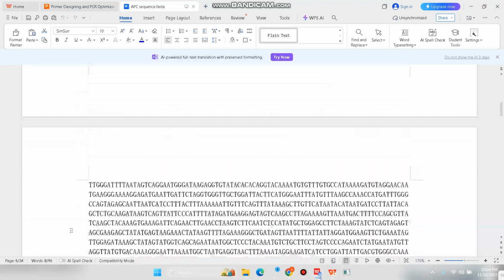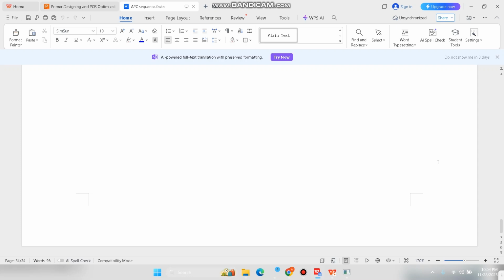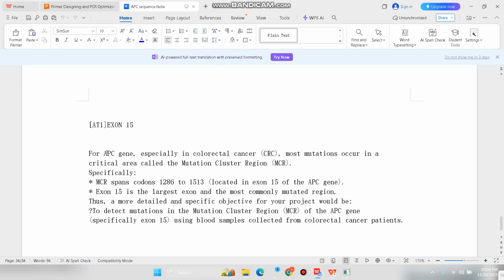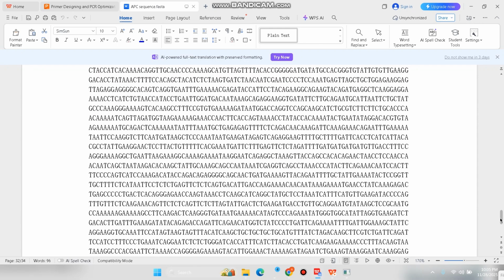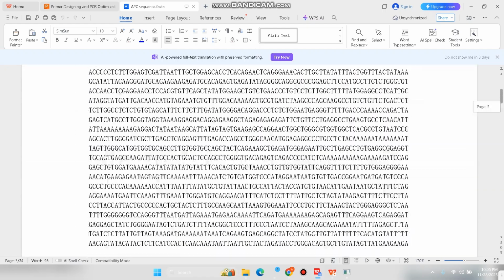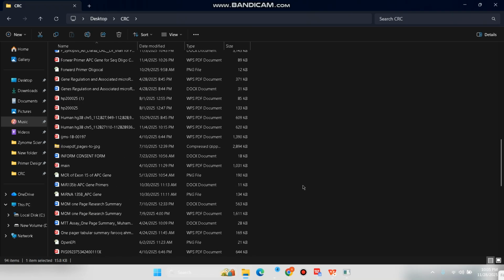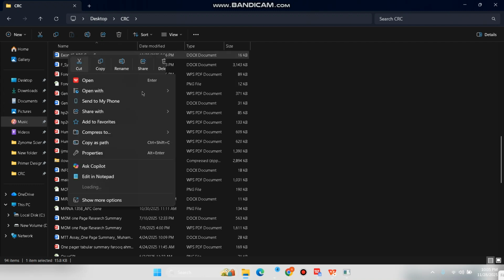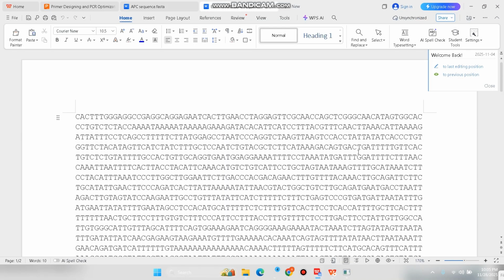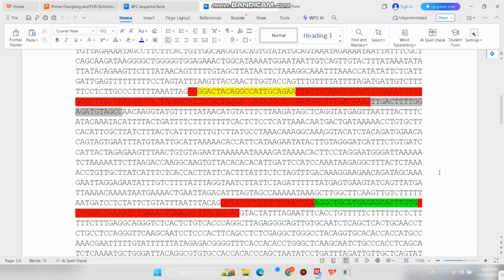It is just the first step. Like we want to design the primers from an exon.